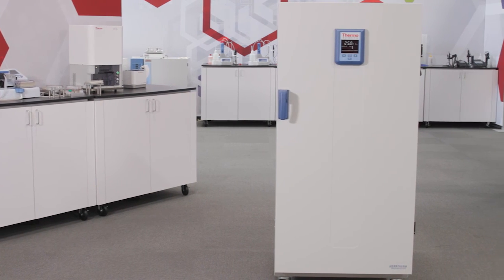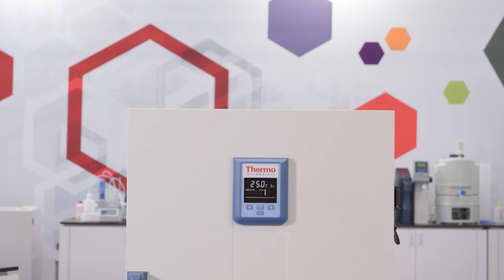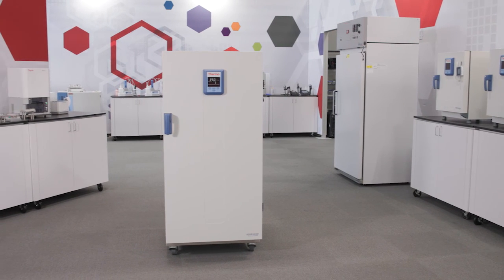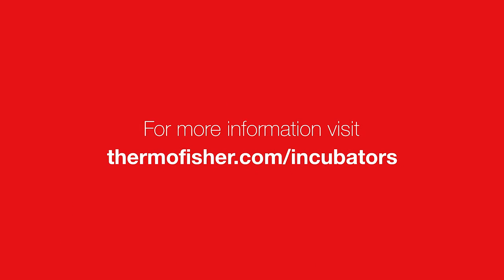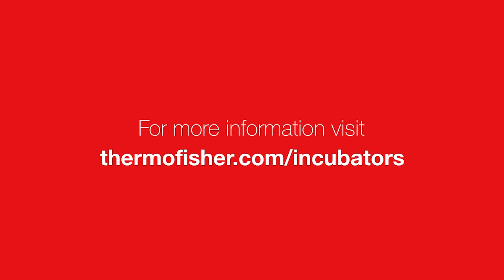Automatic controls of the Peltier module ensure optimal temperature adaptation to provide precise temperature control. As with the entire Thermo Scientific Heratherm family, the Heratherm refrigerated incubator is designed with your samples in mind. We hope you found this video helpful. For more information or questions, please visit us at www.thermofisher.com/incubators.